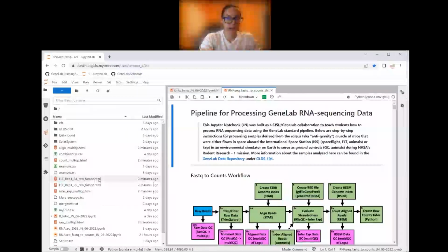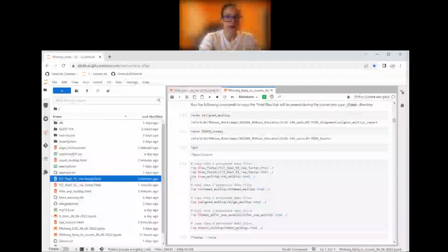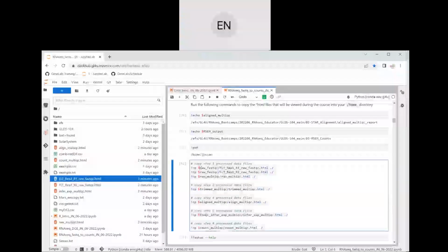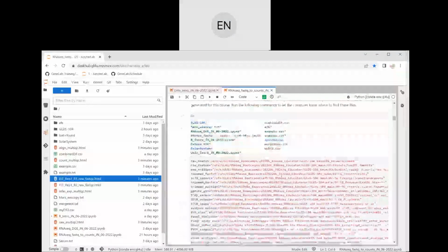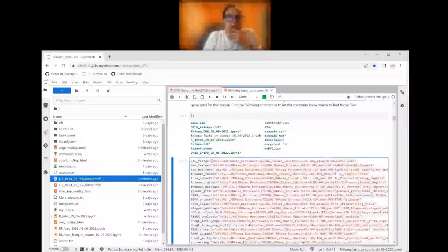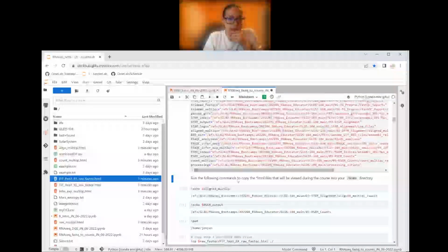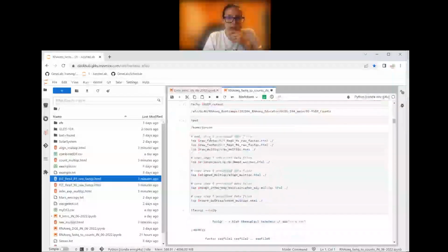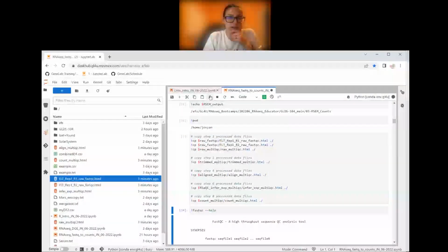If you scroll down in your notebook and rerun the alias or the variable setup, the one a little bit higher, cell 27. Yeah, rerun that. Okay, and then you can scroll down. Rerun your copy one just in case, cell 52 that you have there. An asterisk there, 59. It popped up, so it seems like it's okay.